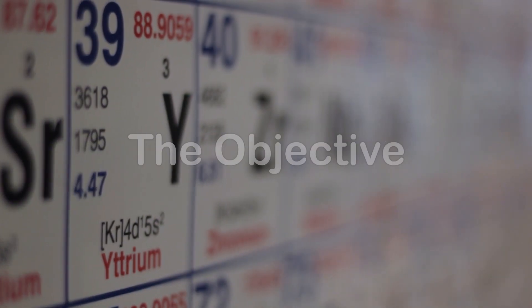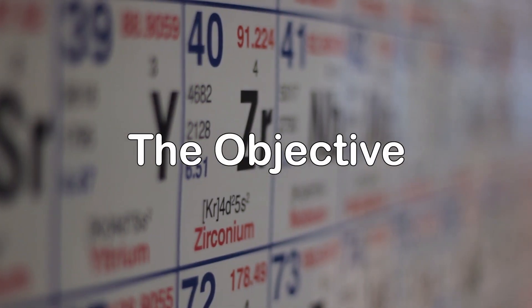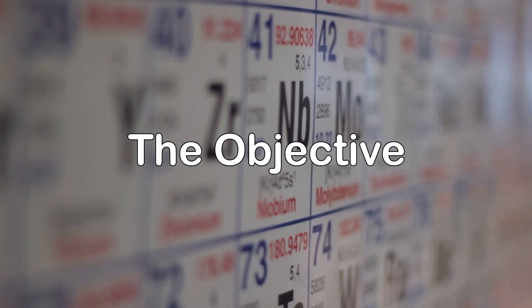Chemical Reactions: Perform multiple chemical reactions of various types and qualitatively observe the outcomes.